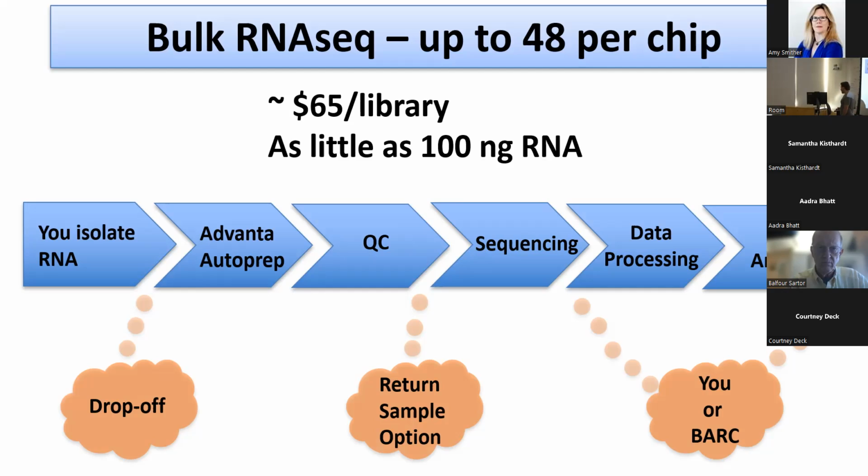I already mentioned that because it's a microfluidic or automated approach that essentially a machine does, there's no pipetting, really, where you can introduce mistakes between samples. And so this allows you to do more biological replicates rather than doing technical replicates to generate your libraries.